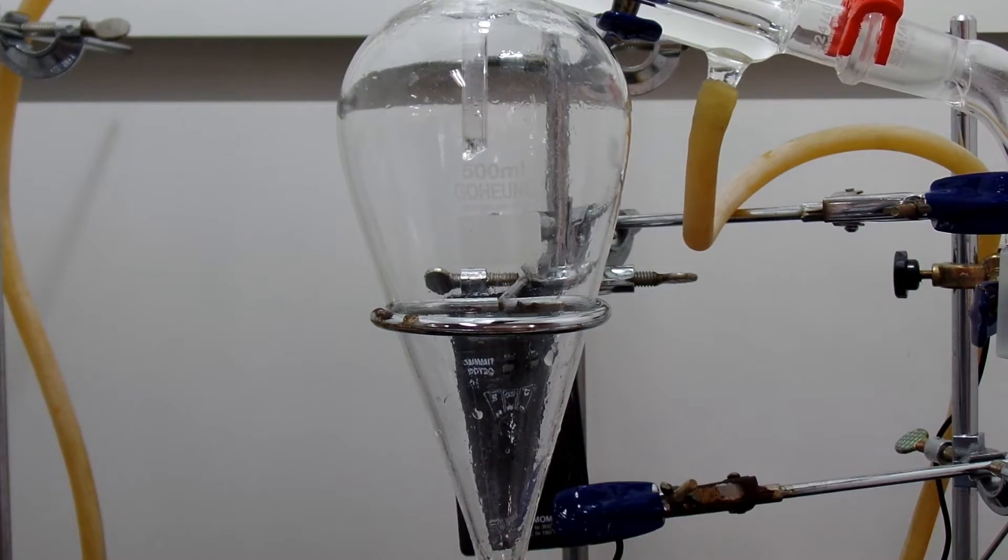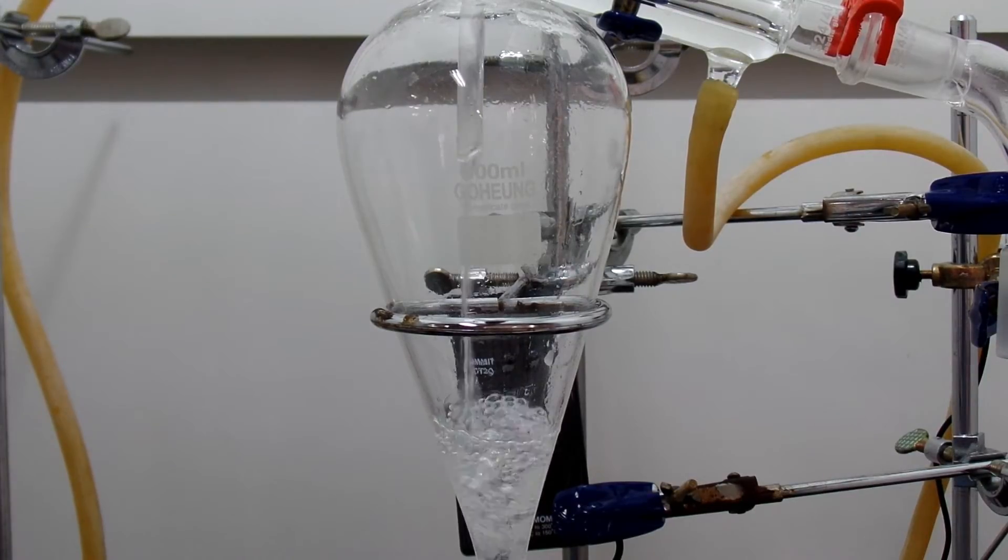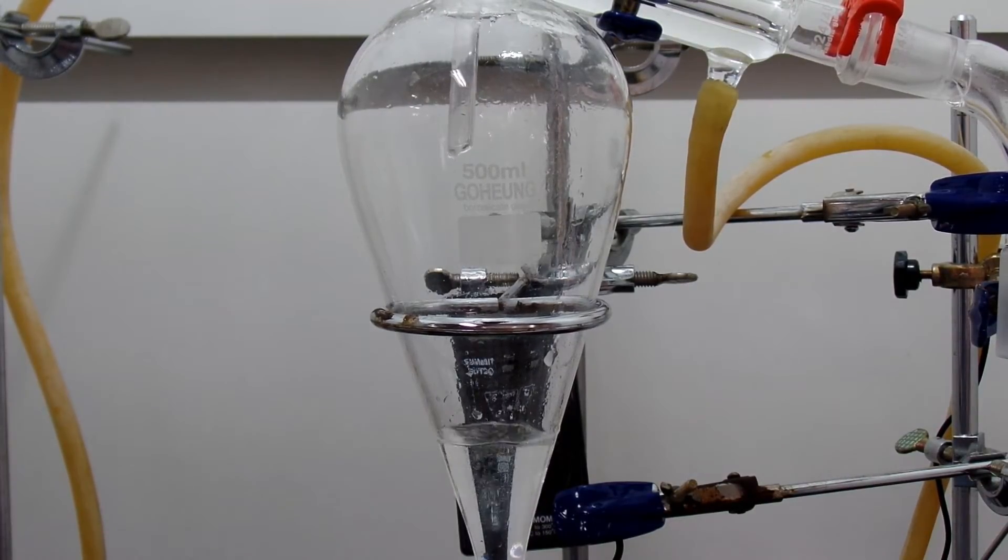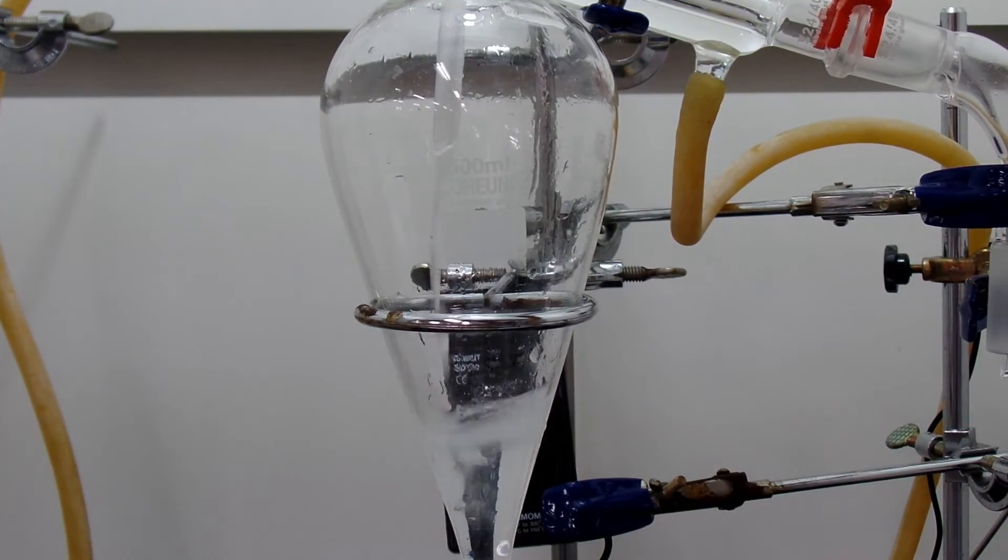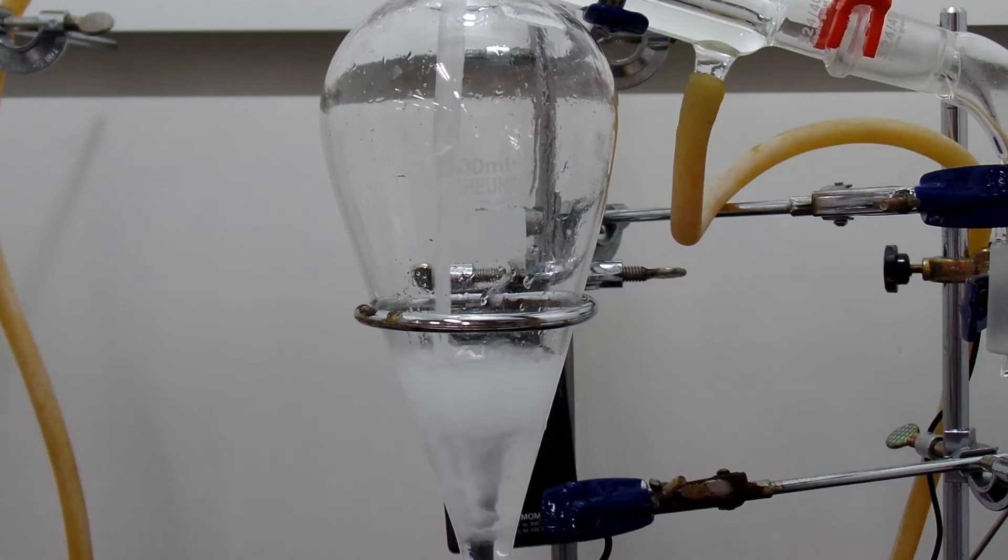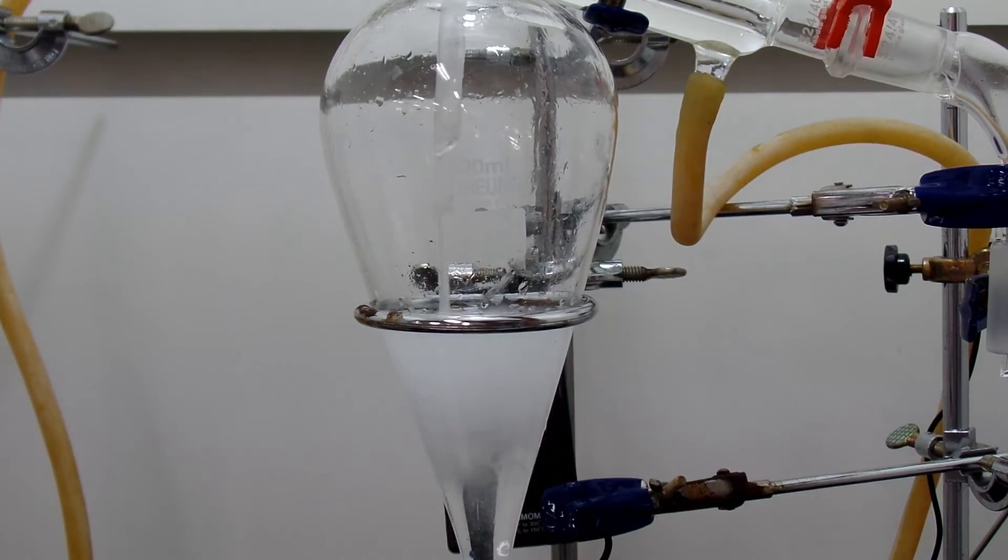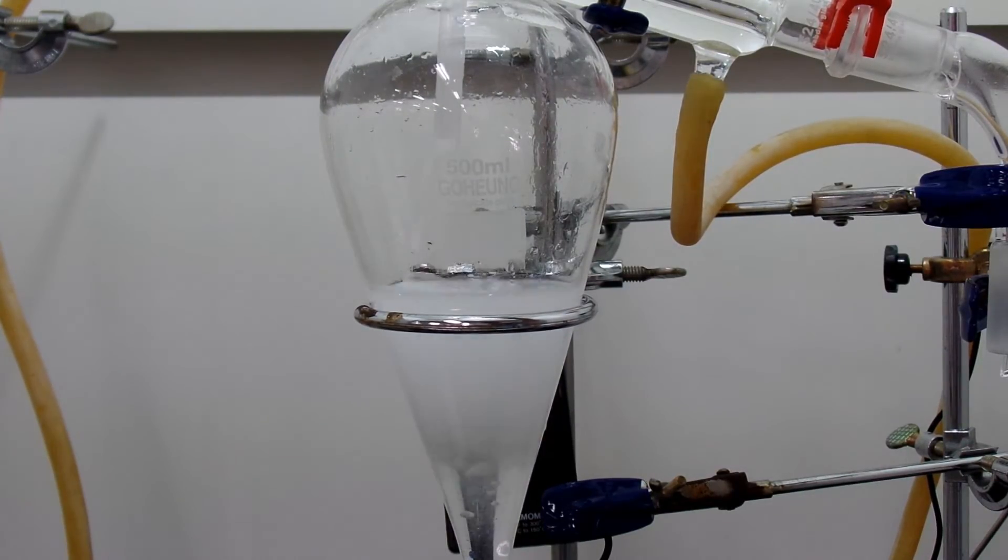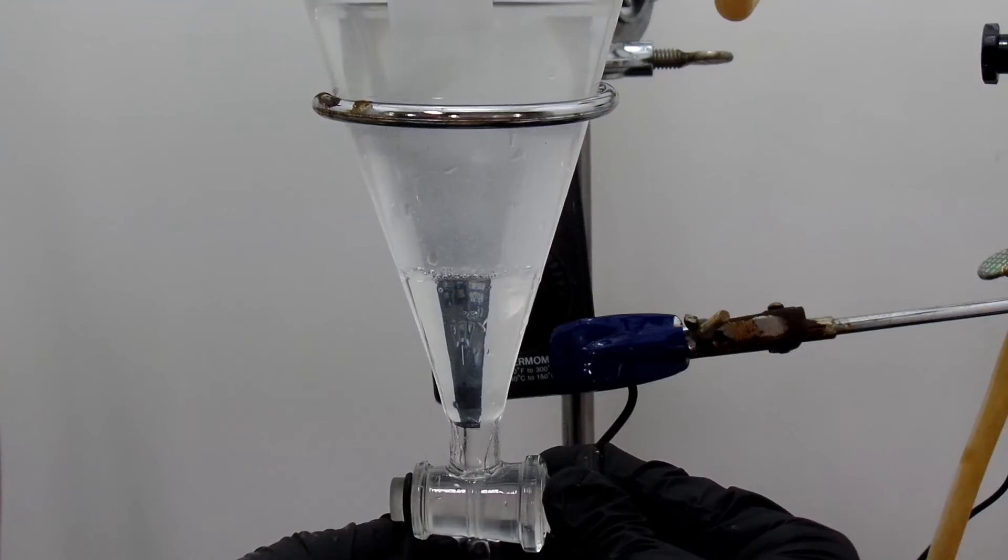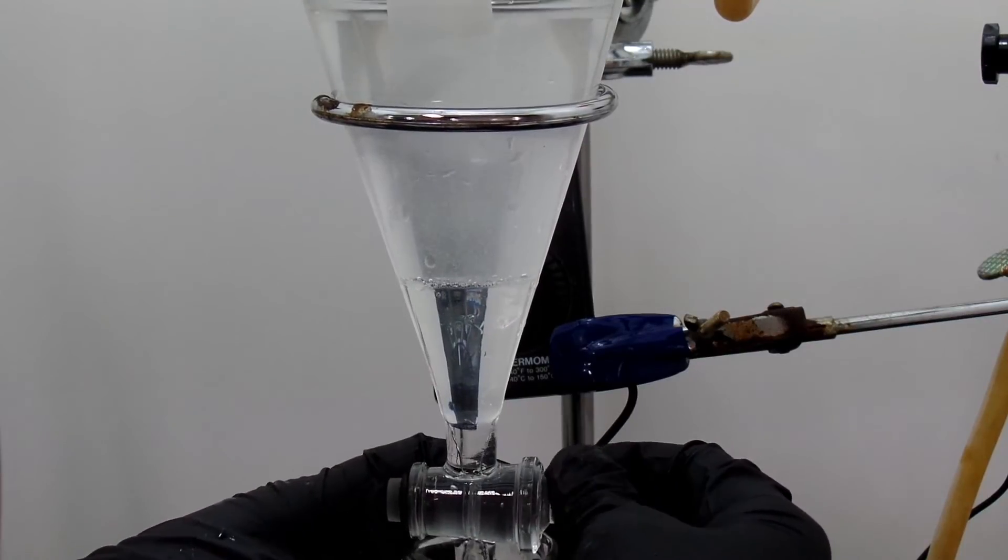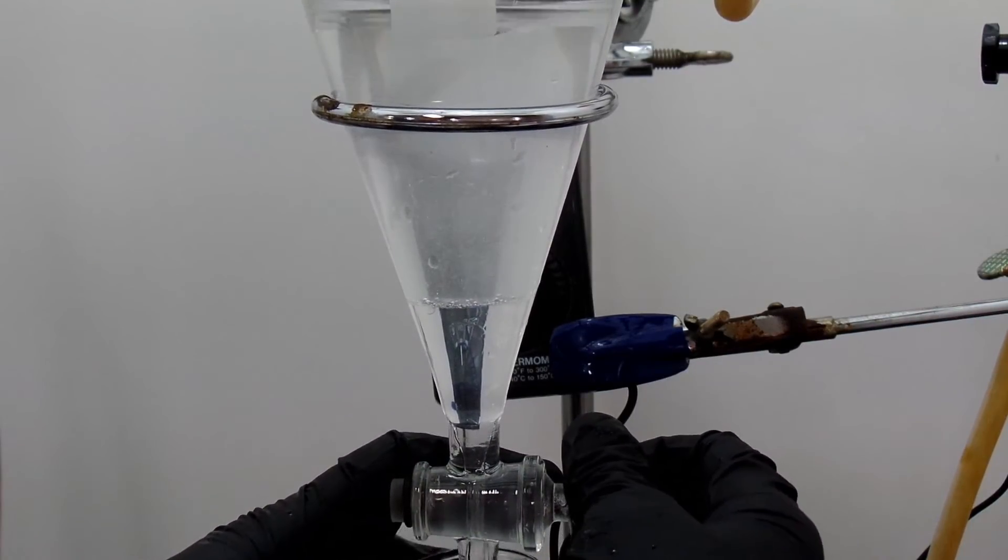Again, add the lower layer to the separatory funnel and add saturated sodium bicarbonate solution. This is also shaken and vented frequently. Obtain the lower layer. I didn't do it here, but I recommend another washing step.